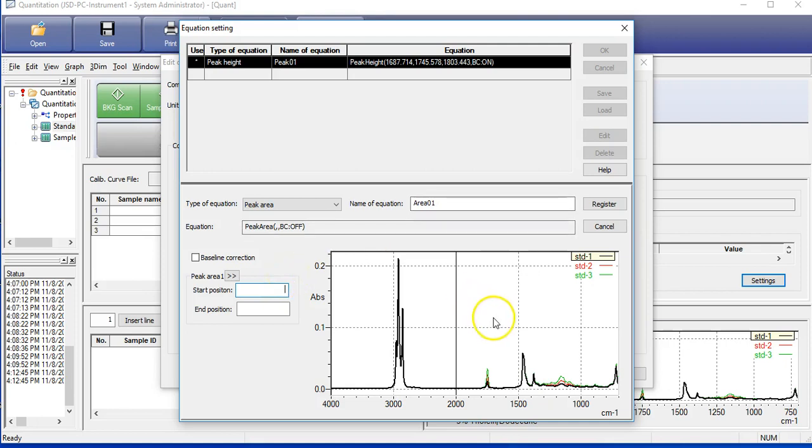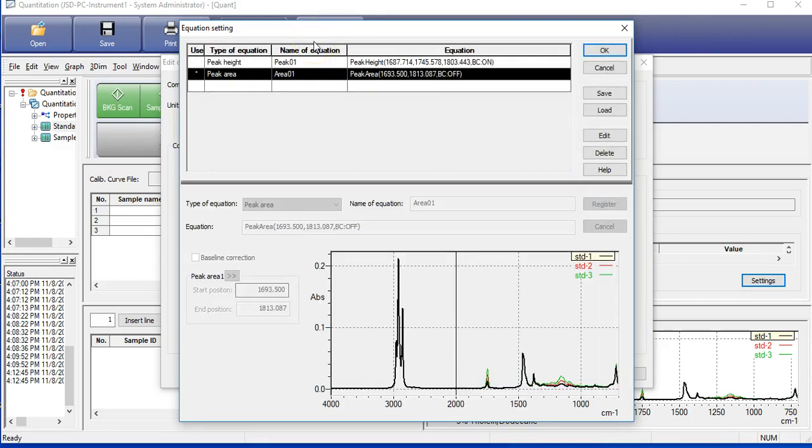And then what I'm going to do here is I'm going to select this here. You can see these two red lines come up. I'm going to move this over the area I want to utilize. Click it over it and you drag that over. Okay. So it's going to take the peak from that to that, and you'll see the gavel here. I bang my gavel, and it enters it into the table. Now I'm going to say register that, and there we have peak height and peak area.